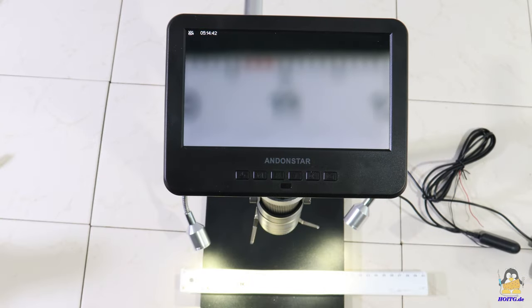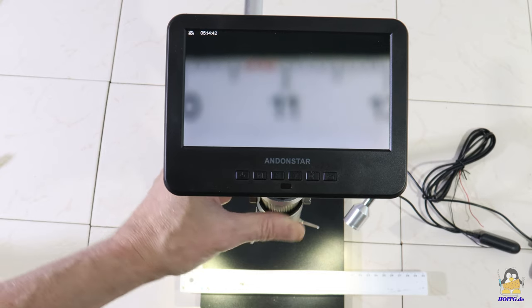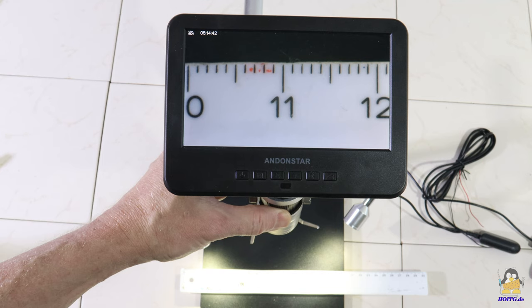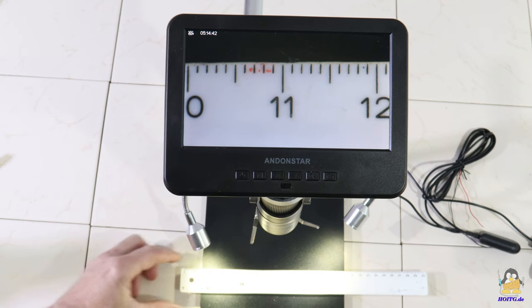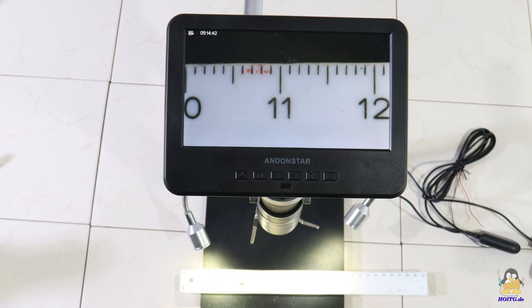There is a lot of cheating when it comes to the magnification factor, so I'll give you a rough estimate of what small structures can be captured with the optics. I start with lens A, which is first brought to the maximum height. The camera captures 22mm of the ruler.